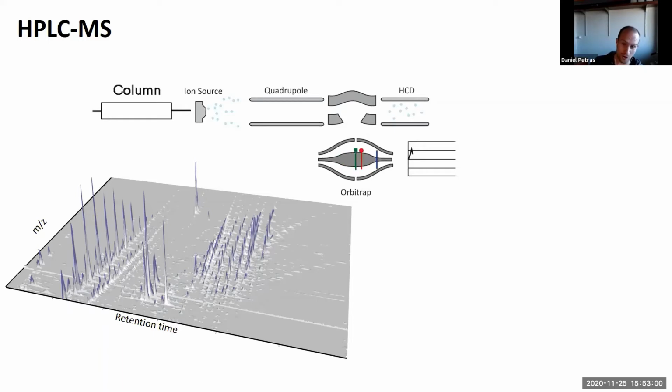Now you probably also know, and we spoke about that already with regards to resolution, that of course a certain mass can have multiple elemental compositions depending on the accuracy you measure this with. And certainly there can be many isomers, or many different compounds, that all have the same molecular formula. So often this is really just the first step to annotate or solve the structure of an unknown compound, or to dereplicate this against other already known compounds.